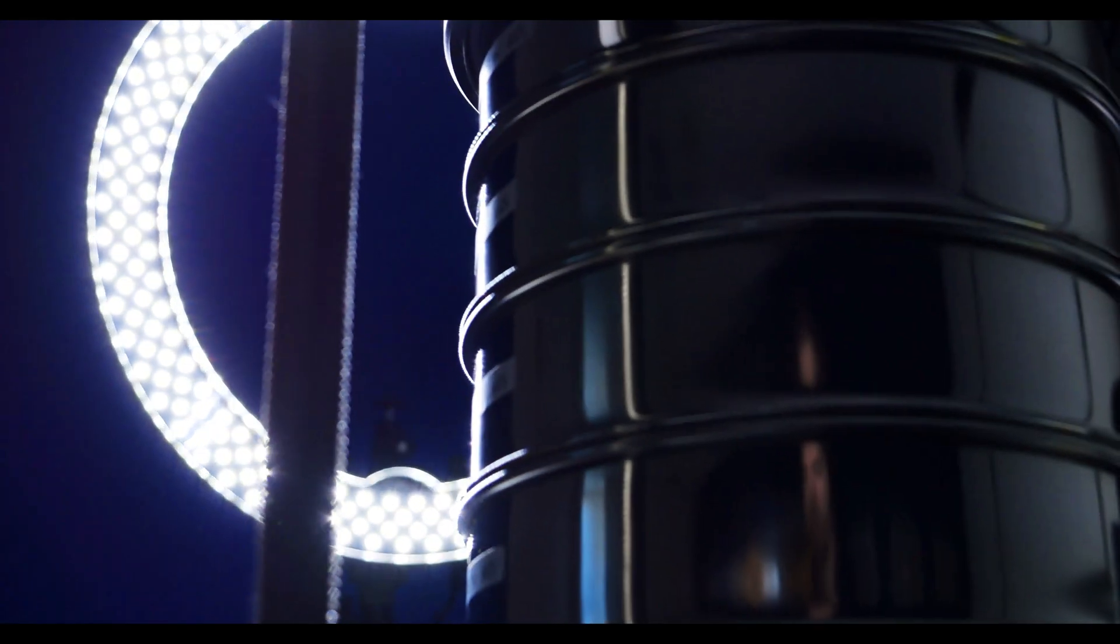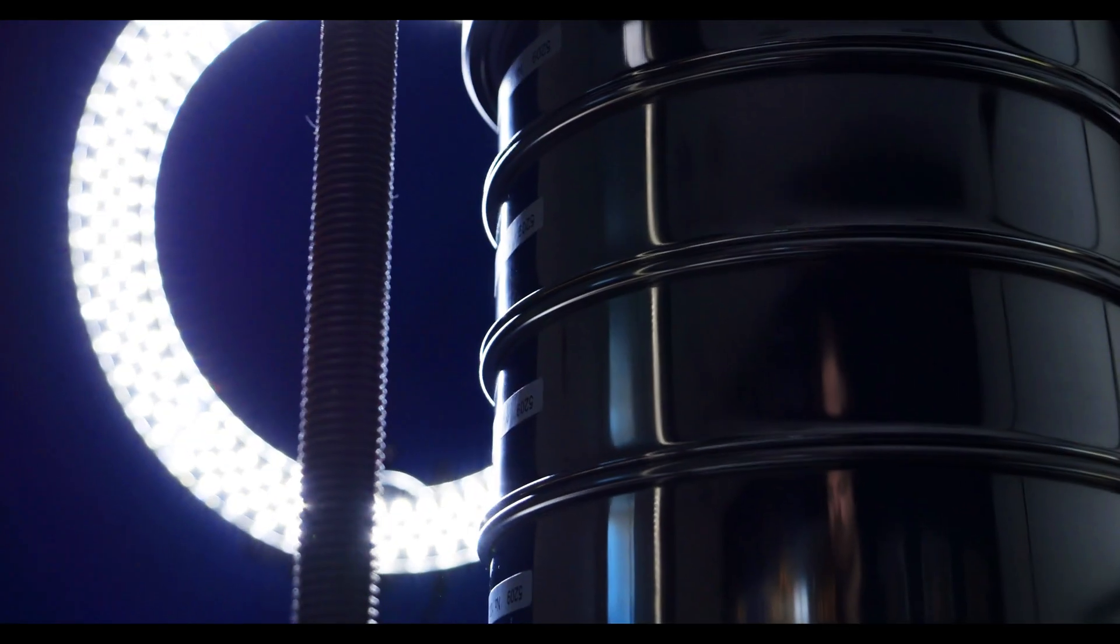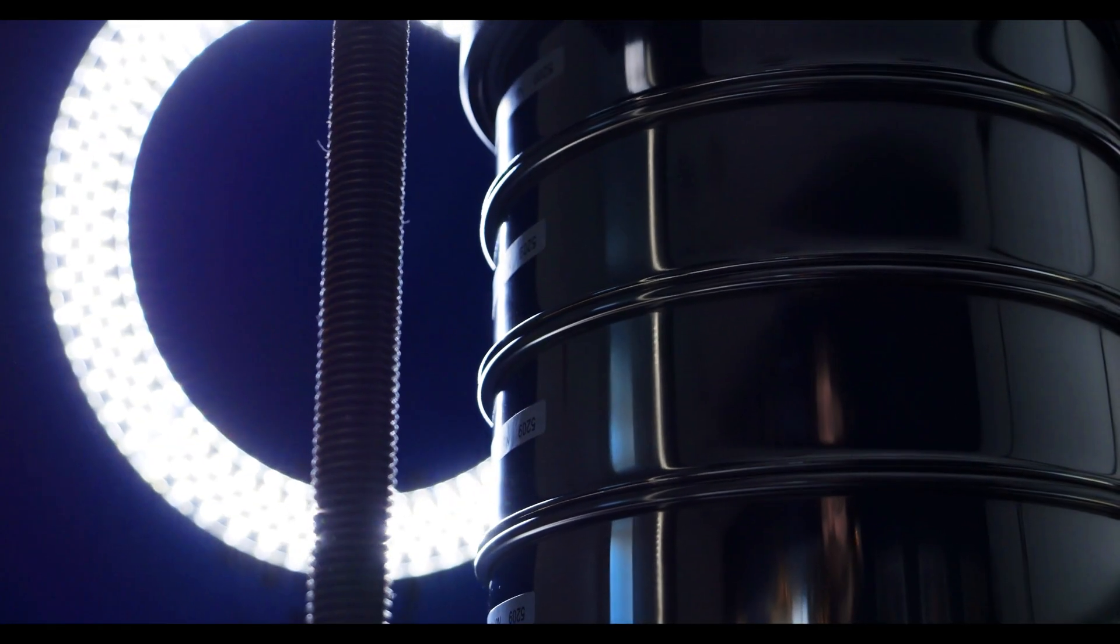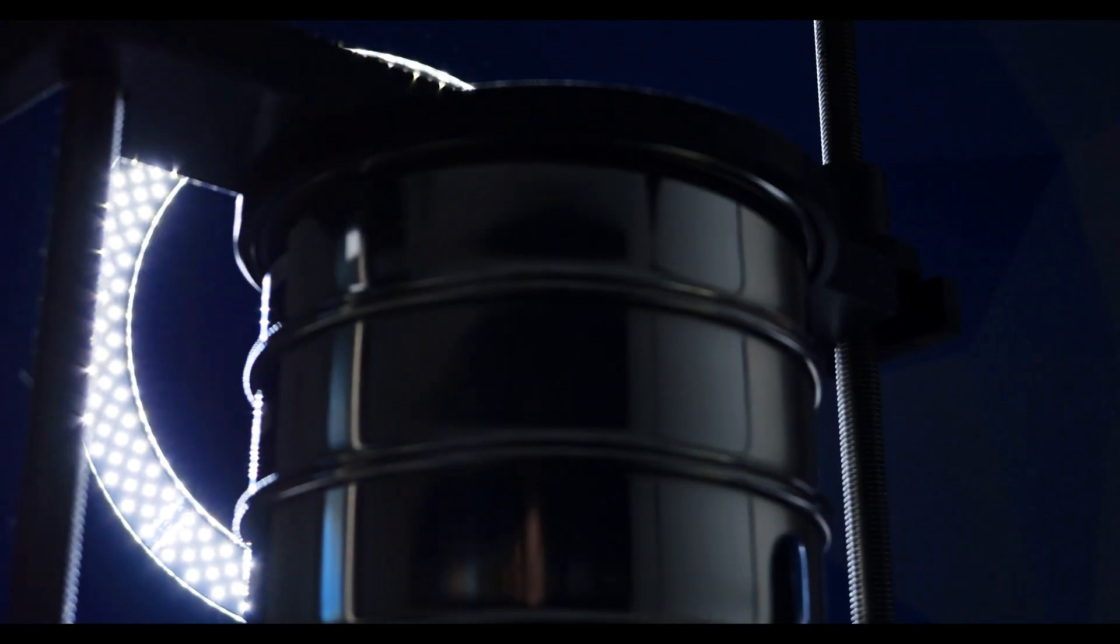With 8-inch sieves, you can have 6 full-height test sieves or 13 half-height sieves. If you're using 12-inch sieves, you can have 4 full-height sieves with a collection pan, 6 half-height sieves, or 8 half-height sieves with a collection pan.